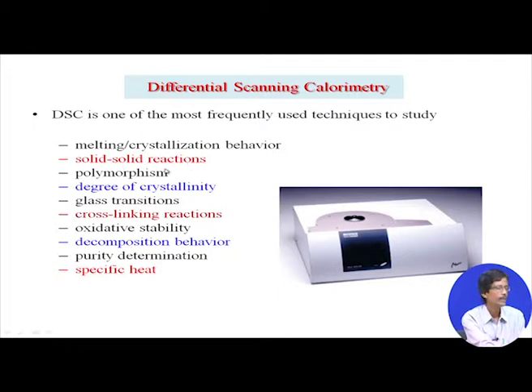So, the DSC trace for a particular type of solid state reaction. We all know that you can go for a simple metal complex preparation. One good example is well known, the preparation of Reinecke salt. The preparation of Reinecke salt can be done by using simple solid-solid reactions. So, on a sand bath we heat one solid component with the other solid component, but the ultimate product is a well known, different type of metal complex.